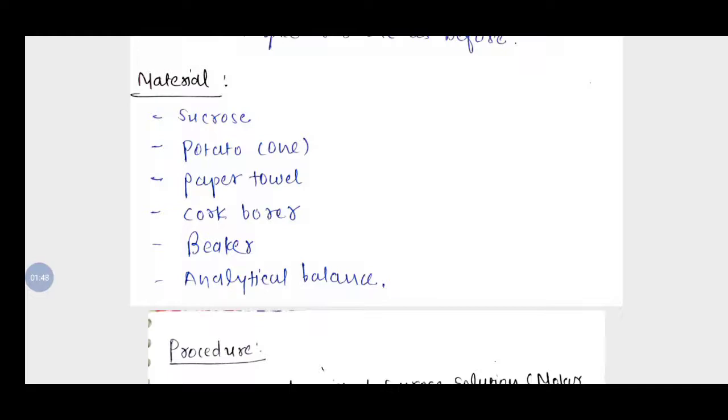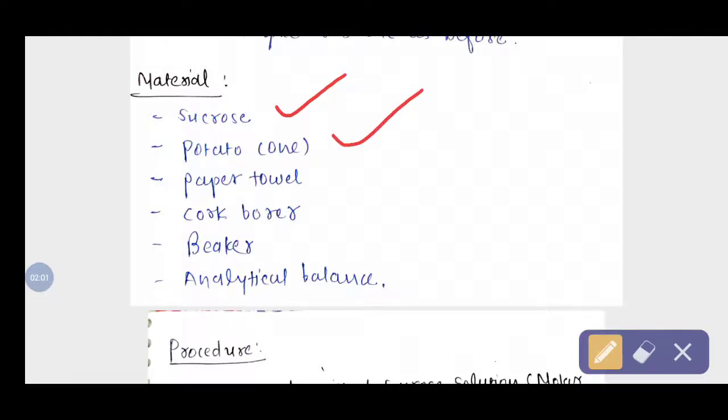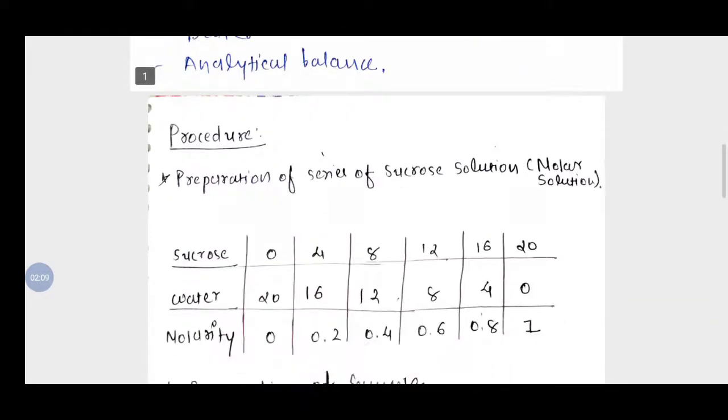Now we will discuss the materials used in the tissue weight method. These are: sucrose (for making different molar solutions), one potato, paper towel, cork borer, and an analytical balance.